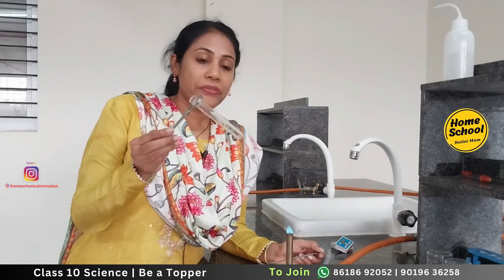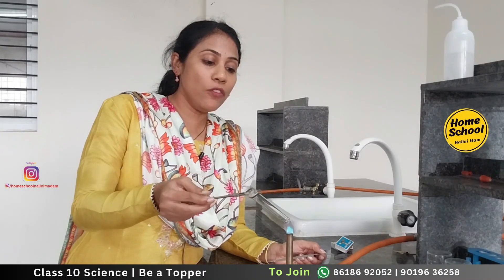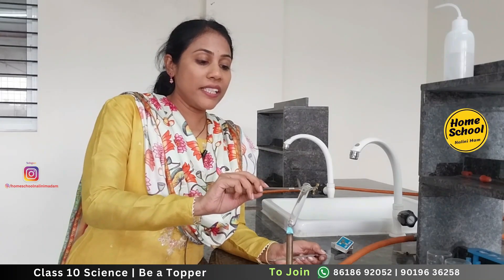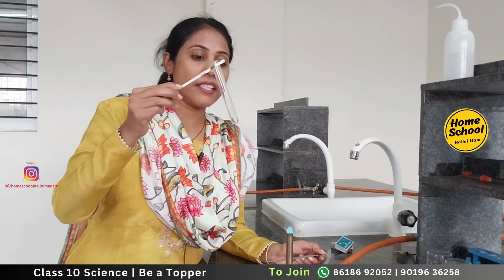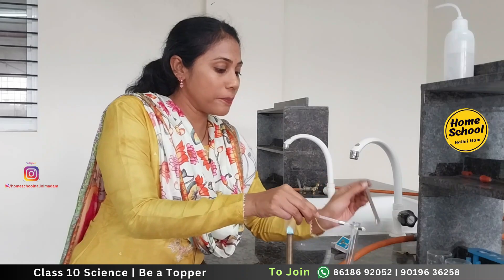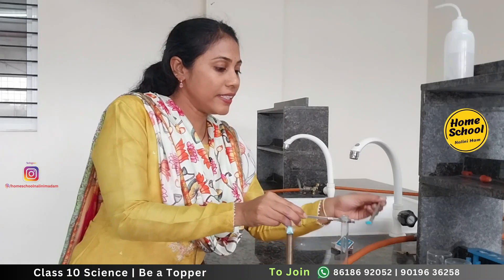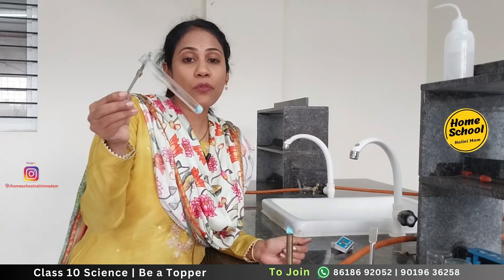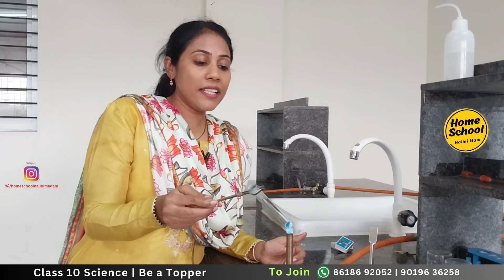I have taken a dry test tube — it is very important to use a very dry test tube with no water molecules inside. If it is not dry, just keep it over a flame until it dries. Now I will take a few crystals of copper sulfate into it, and I will start heating these crystals.